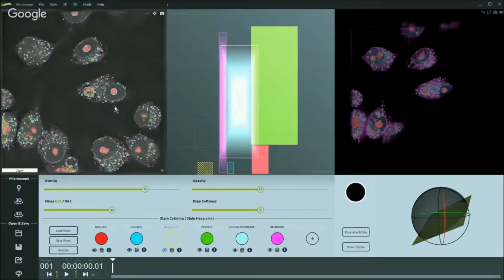And whenever we are now going to measure, with this tool we can select any pixels of interest. And whenever we select a pixel, first of all we get the position, but also we get the specific refractive index. Okay.